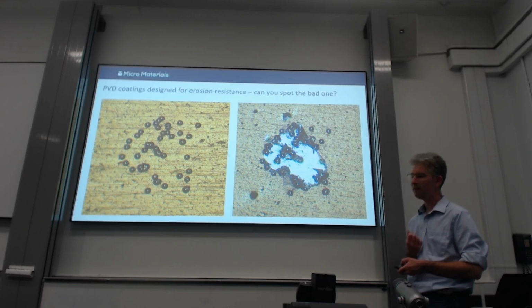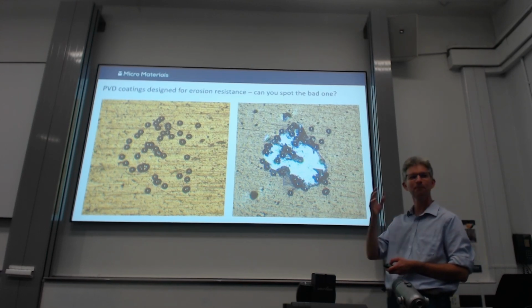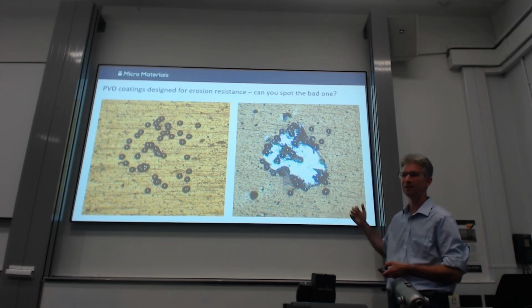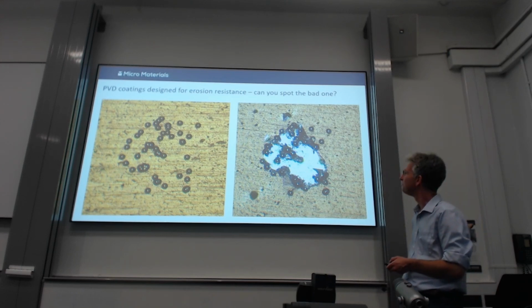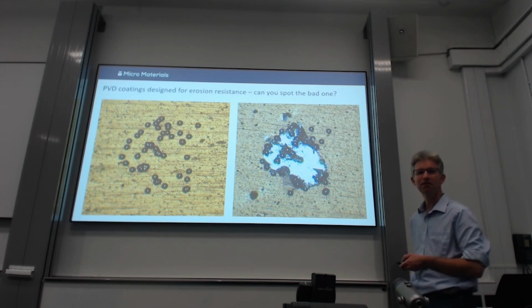And they were quite proud, the guys on the left, about how good this coating was, and they said all we need to do is just tweak it to have better high temperature strength, better high temperature performance, and lo and behold, the one on the right is what they came up with. So back to the drawing board, I feel, slightly on that one. Fairly obvious. And the neat thing is that it's exactly the same distribution.